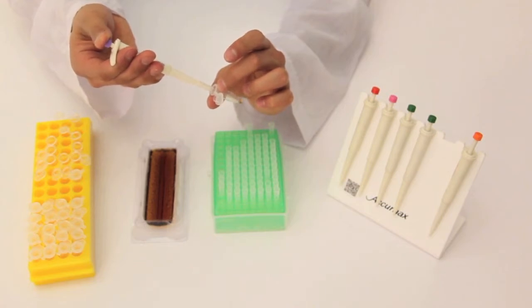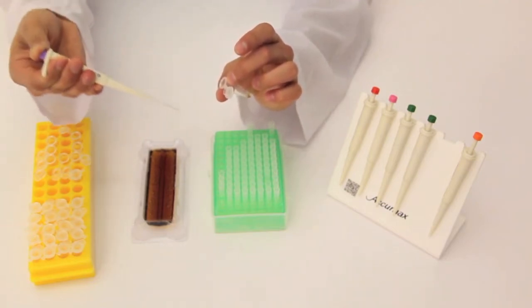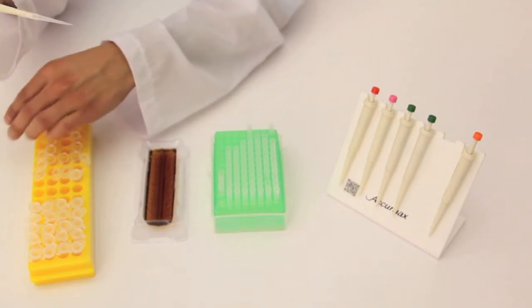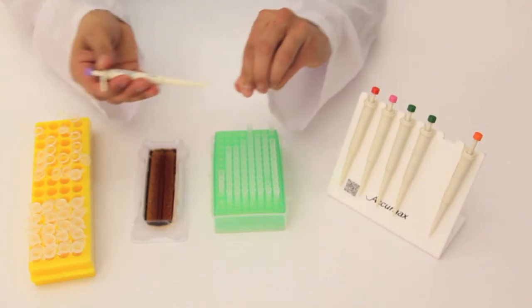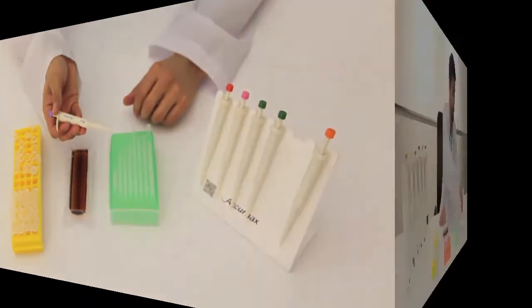Press the knob down to the first stop, and then to the second stop to fully expel the liquid. Remove the pipette. From there you can release your knob, secure your sample, and manually eject the tip using your hand. From there you can move on to your next sample.